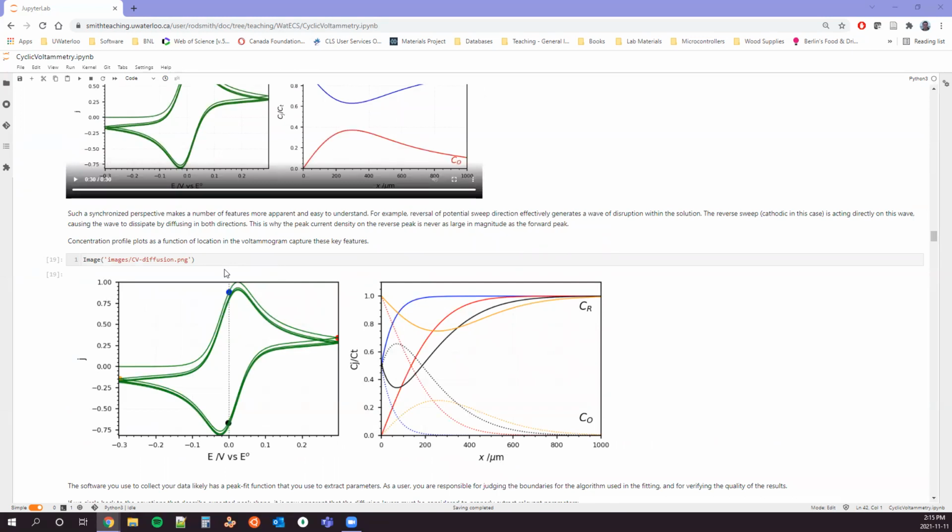If you have a roughened surface with little nodules poking out all over the place, the diffusion layer is going to grow out uniform to that, so it's got that texture to it. But as it goes outwards, it's going to start interacting with each other. They're going out spherically, basically.